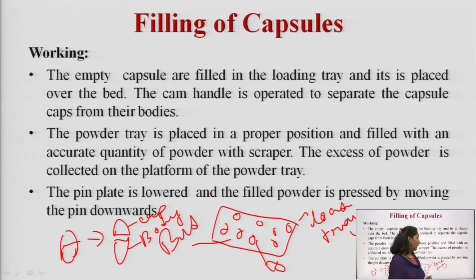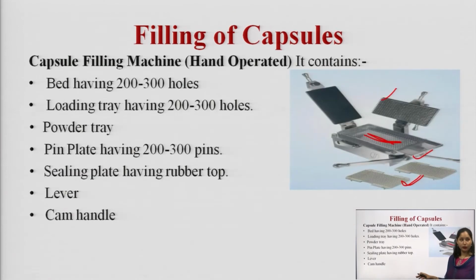Now, what will happen? We place this powder tray over the bed, and we pour the powder medicament over it. We pour the powder medicament, and with the help of the scraper spread it over this bed which contains the capsule bodies. And then what will happen?